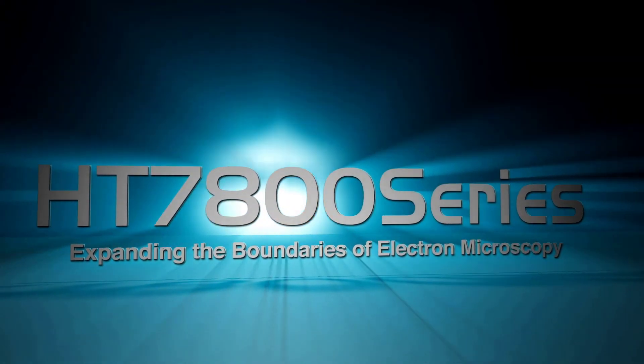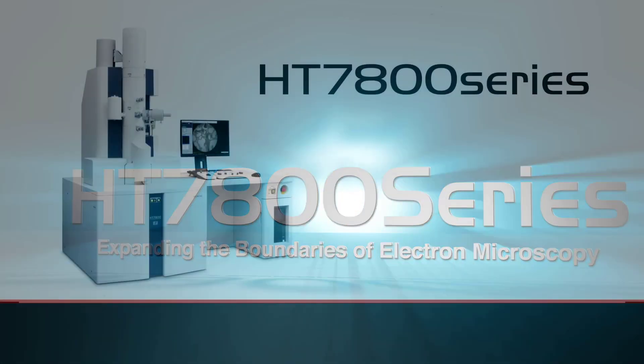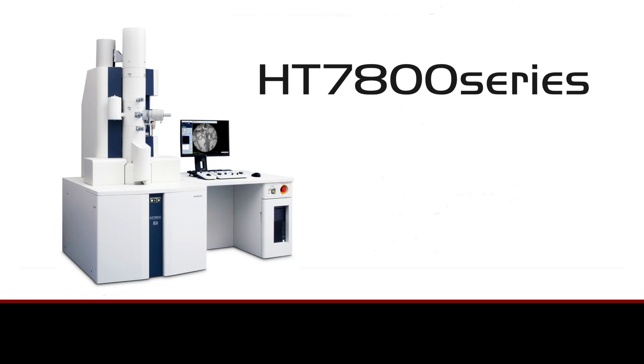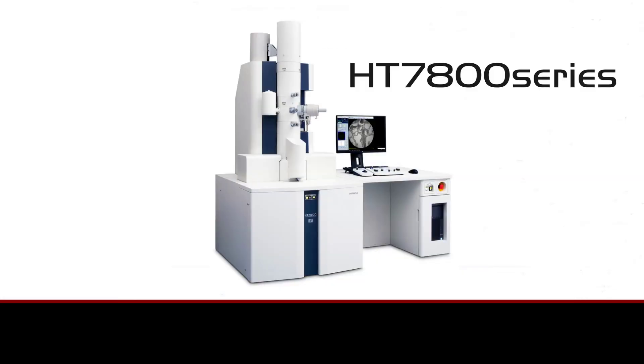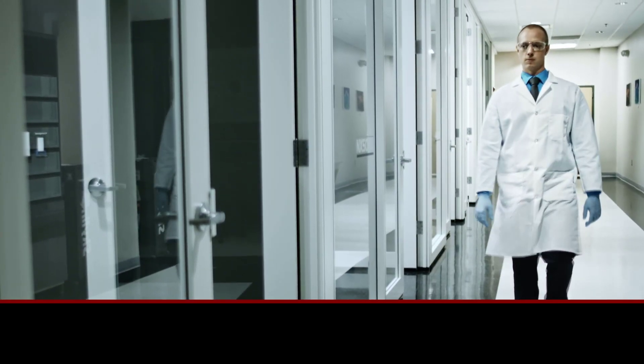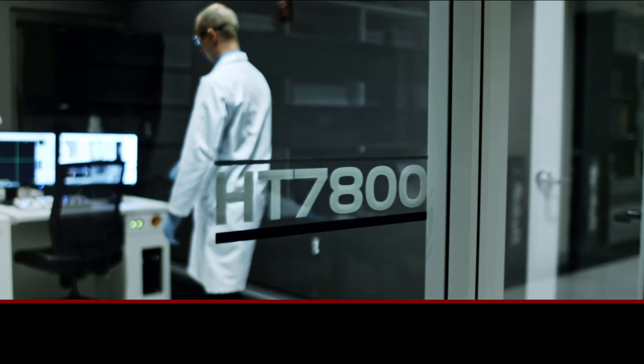Experience the next generation of innovation with the Hitachi HT7800 series and redefine the boundaries of transmission electron microscopy. The HT7800 series addresses a wide range of applications from life science to material science and everything in between.